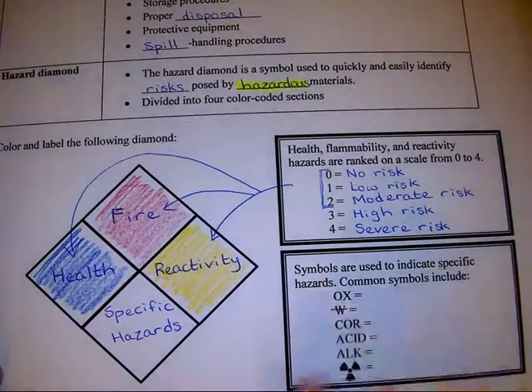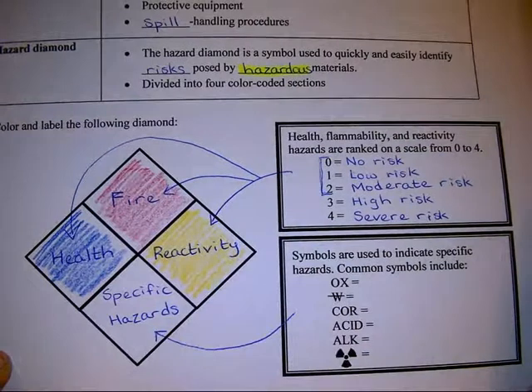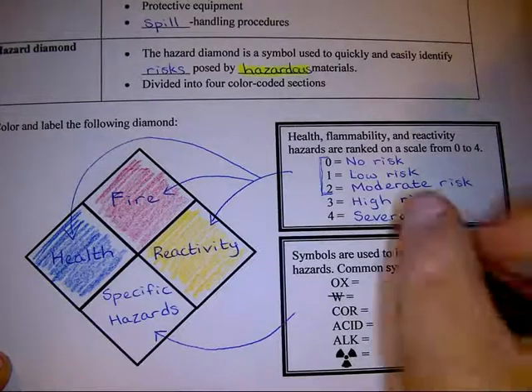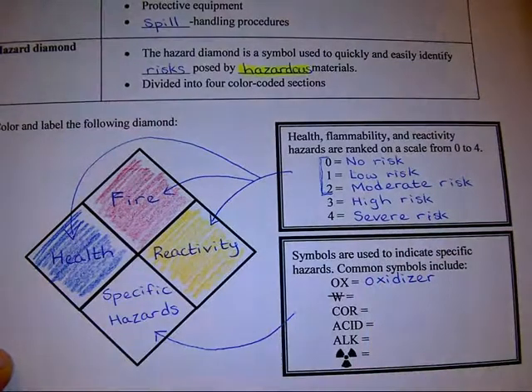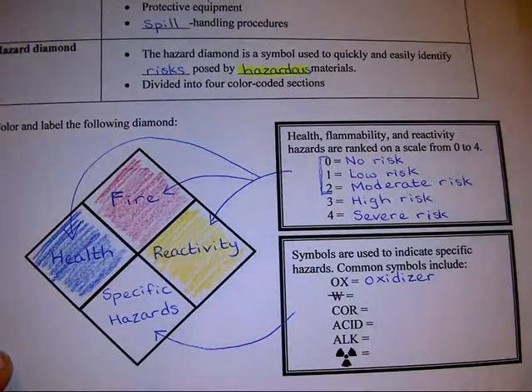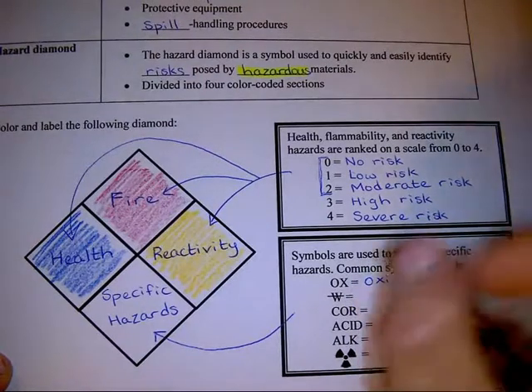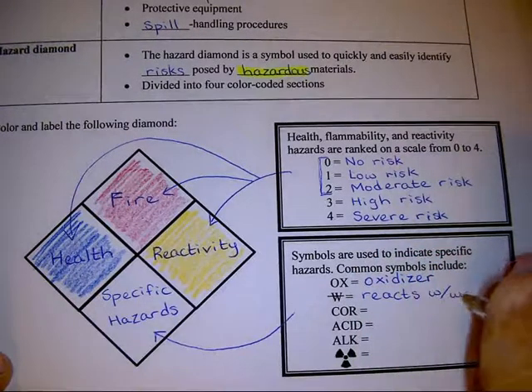Now, in this bottom section, the white section in the diamond, we will most often find a symbol. Sometimes it's left blank if there's nothing else to include, but a lot of times we will find a symbol. Some of these common symbols are listed. OX stands for an oxidizer. These are things that we will want to keep away from flammable stuff, because they can produce oxygen, and we know that fire can burn whenever there's oxygen. W with a line across means it reacts with water, and so these will be things that we want to keep away from water.